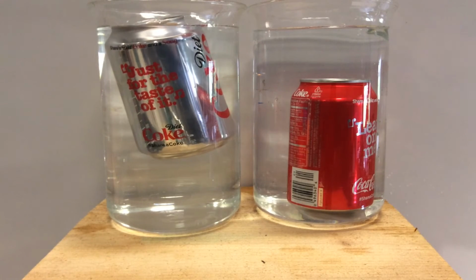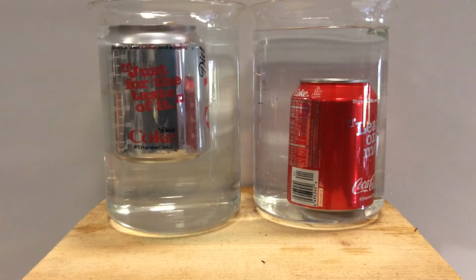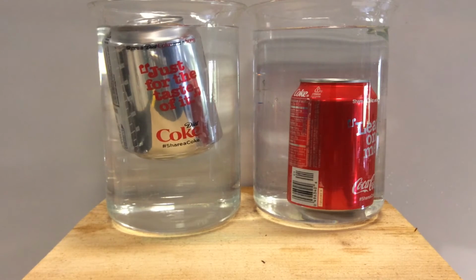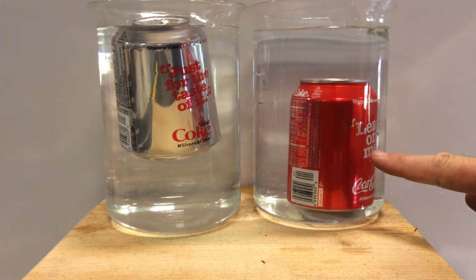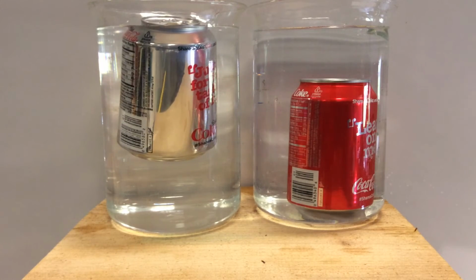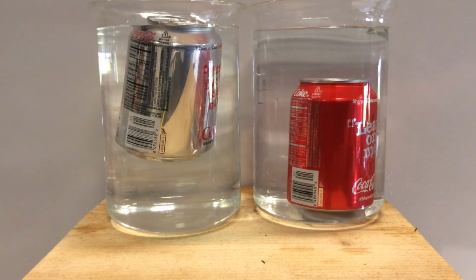Now, we know that's limited in the sense that there is sweetener here, and we're not investigating the mass of that sweetener, but clearly there is a difference, and we're going to test that premise and see how well it works, because we're going to calculate through the density how many grams of sugar this has. Again, assuming that these have the same ingredients, just one has sugar and one doesn't.